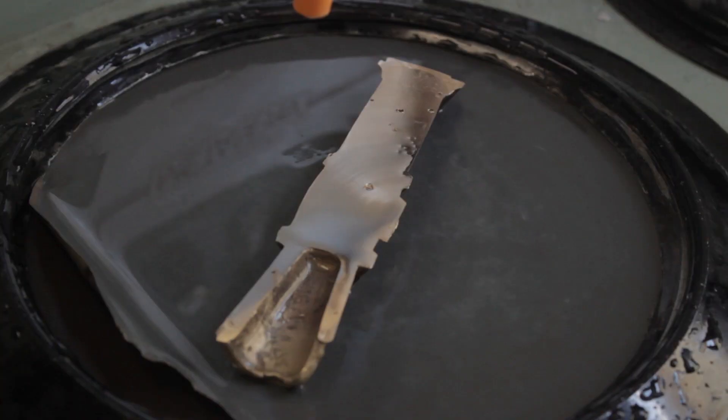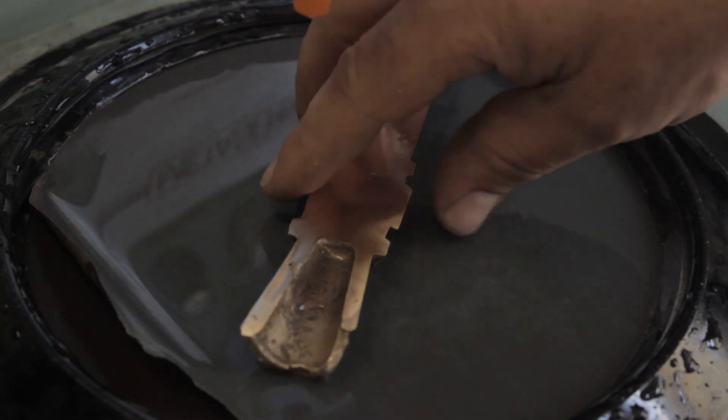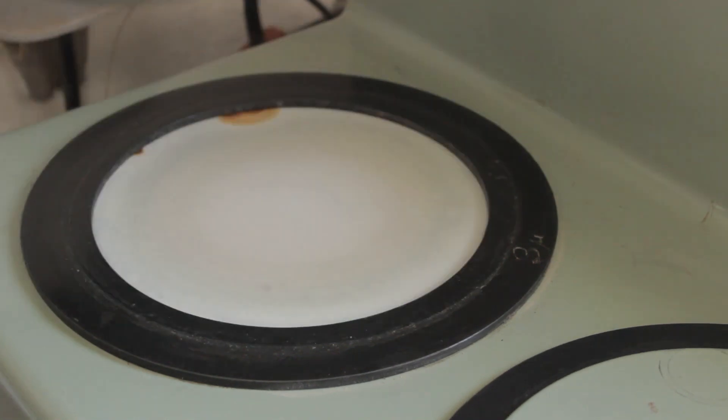This section has now been fully ground. This is 1200 grit paper and it is now ready for polishing. Here we are at the polishing disk. The first polishing step is 3 micron diamond.